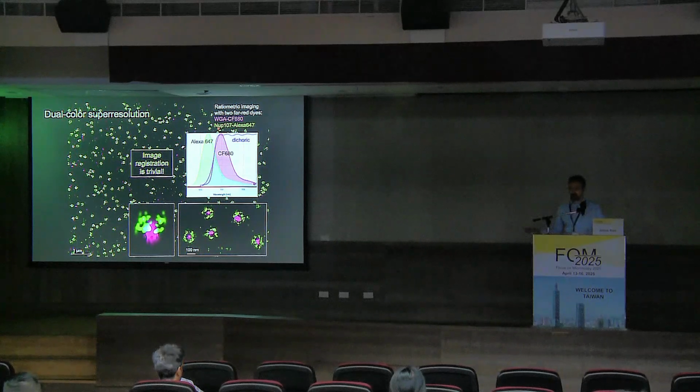But for standard microscopy, that would be a horrendous mess. You couldn't use this at all because of the super strong crosstalk, because you see both fluorophores basically in both channels. But in single molecule localization microscopy, we have the advantage that we know we look at single fluorophores only, and they can be either one color or the other color. So we just have to look at the intensity ratio between these 2 channels to uniquely assign the color.